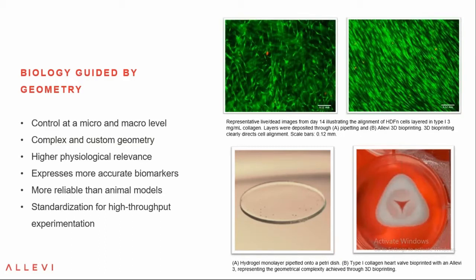And what we can also see is that bioprinters can take materials that were first just random slabs, just a gel, and begin to pattern them in relevant physiological shapes, like a heart valve, a tricuspid valve, a knee. These are more macro-based geometries, but this has potential for custom-based implants, and it's a really exciting future for us as we think about being able to create novel medical devices.